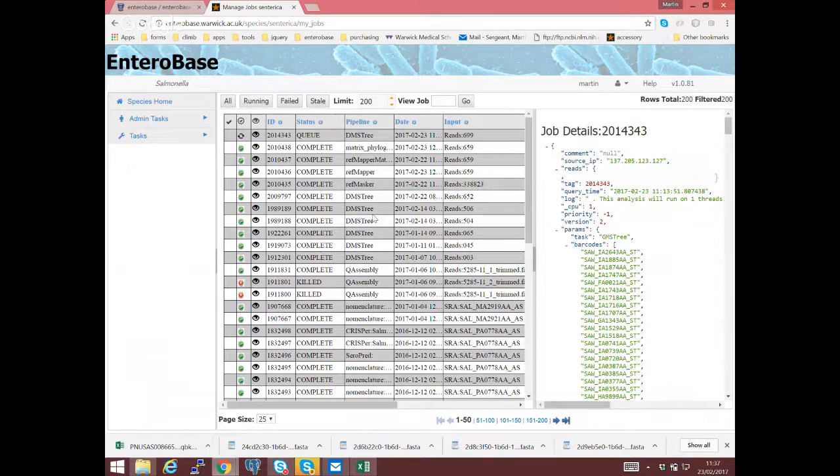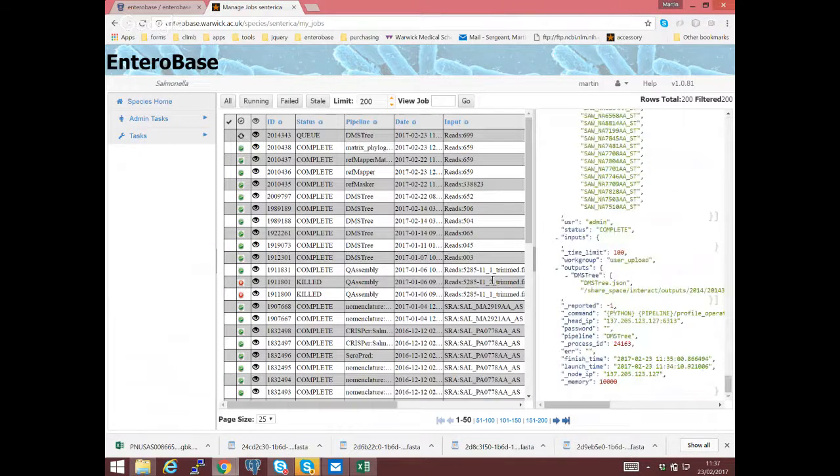That's why we provide the lab contact, and if you want to present it, you should probably just double check with them. If it is in a paper, and you find the paper, then there's no problem, obviously. I think most people don't mind for trees after our interaction with a lot of data uploaders, because it doesn't say anything specific about your data. But I would always check with them.